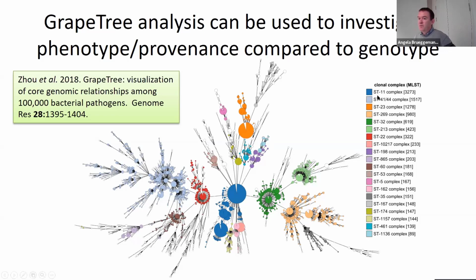So if you had years here, you can color these nodes. You can choose to show them as categories, in which case they'll use different colors that are as different from each other as possible, or you can show it as a gradient. If you're looking at age data, so years, then you show it as a gradient.